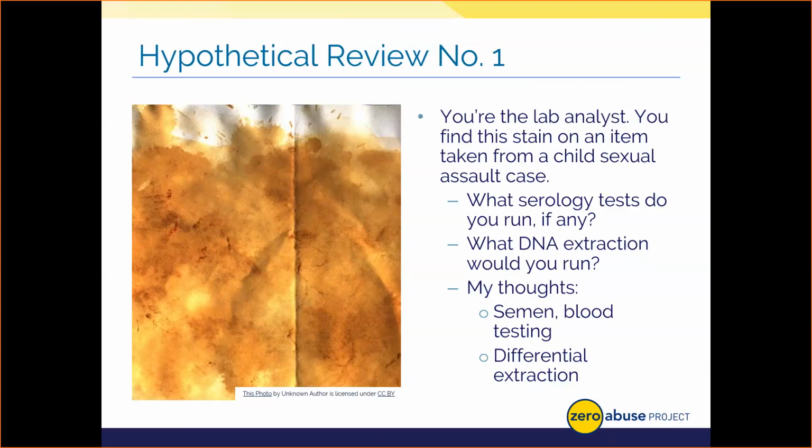Having both pieces of information, if they test out positive, will allow us to move on to DNA, and that could be more informative than just testing for one bodily fluid. So I like the idea of testing for blood and semen, just because, again, if the blood is from the victim and the semen is from the perpetrator, now you have this more well-rounded observation regarding your case.